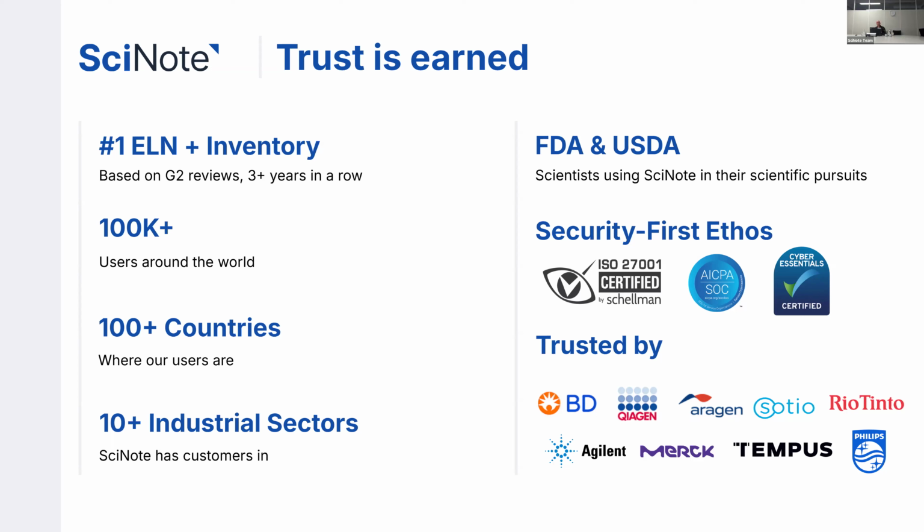What we as a company stand for is really a security-first ethos, making sure that everybody in the company knows what security means. So we are also ISO 27001 certified, SOC Type 1, Type 2, and Cyber Essentials certified. And then on the bottom right side, you have some of our customers that are using SciNote ELN and inventory in their lab work.